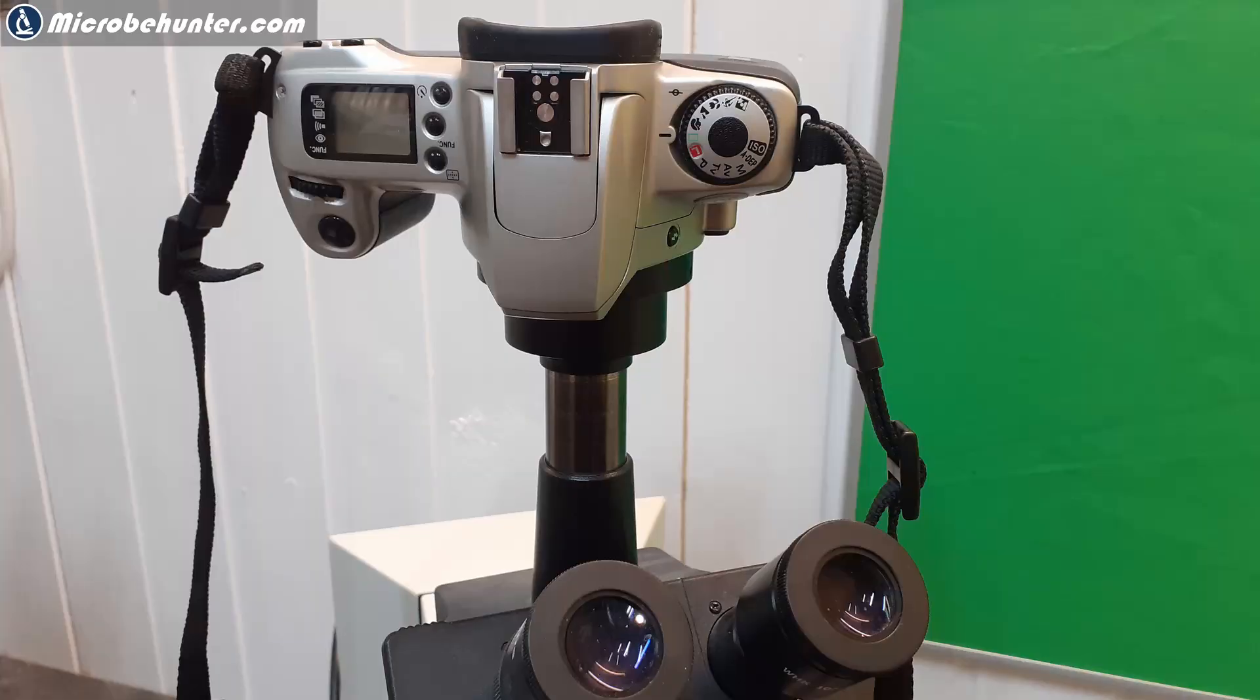But interestingly, I tried this out, gives me a lower field of view than if I use this one here. So, give and take. What I recommend is the following because those general purpose adapters, they might not be the greatest. I've seen, especially this one was extremely cheap and it does introduce some aberrations but it's good enough, considering the fact that the price is relatively low and that you can actually have a very simple solution of connecting a DSLR to a microscope. I actually would say don't overthink the whole thing too much but get yourself one of those general purpose adapters and try it out if you're satisfied or not.